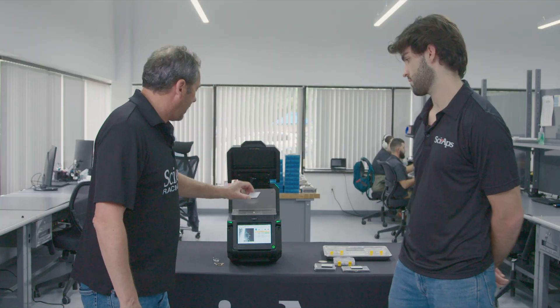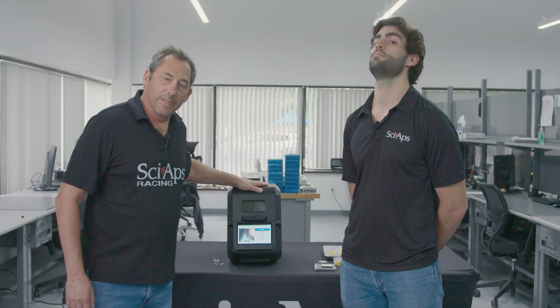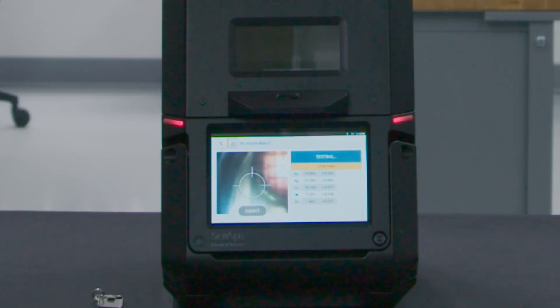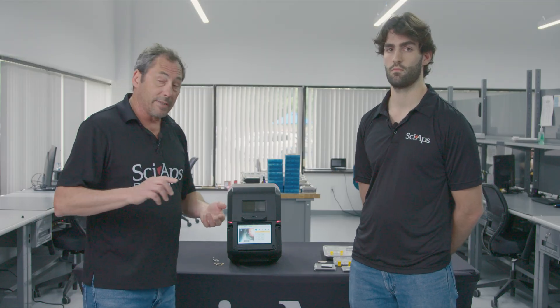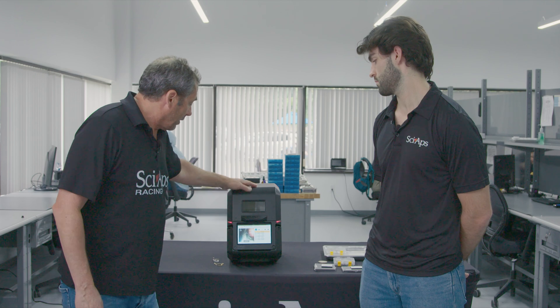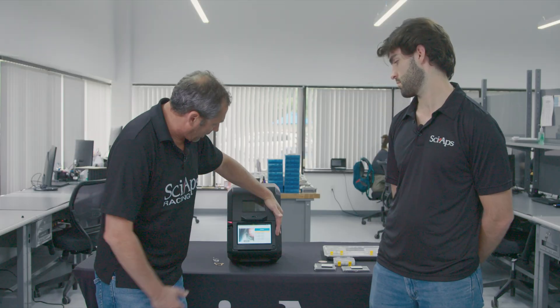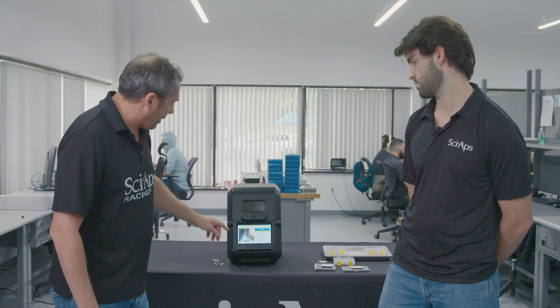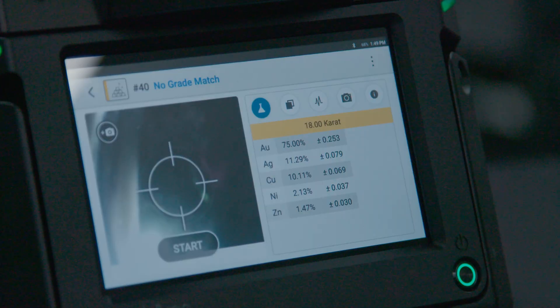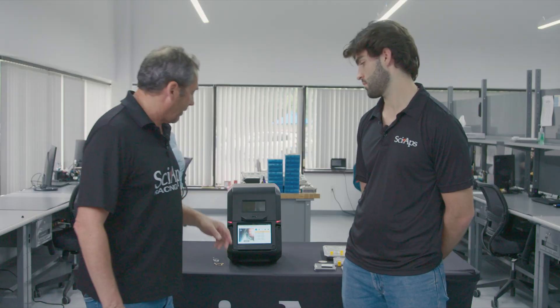Let's start with a run-of-the-mill 18-karat material — put it on there, shut it, do a test. The nice thing about this system is it's very fast. You get a result in about a second. We have this set up for 10-second tests, but you'll get great precision very fast — much better precision, much faster than any other portable or benchtop gold caretting system on the market. We can swipe back and forth: that was 75.00% gold in the last test, 74.97 in this one. A difference of 0.03% — that's really, really good.